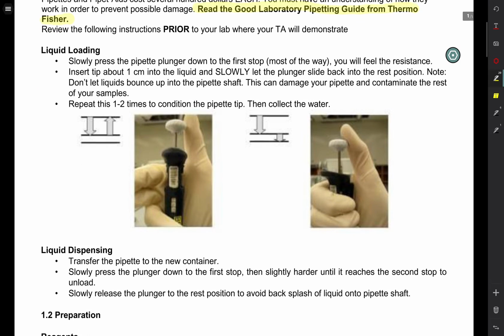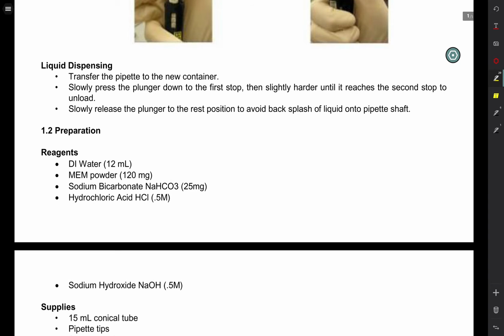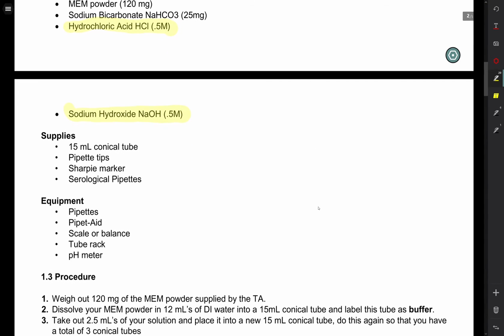Before we move on to the procedure, I just want to point out that you should be looking at the MSDSs for the different chemicals we're using in this lab. In particular, we're using hydrochloric acid and sodium hydroxide, both at a concentration of 0.5 molarity. This is not particularly strong, however, you still may experience discomfort if you spill some. So read up on the safety information so you're prepared in case that happens.